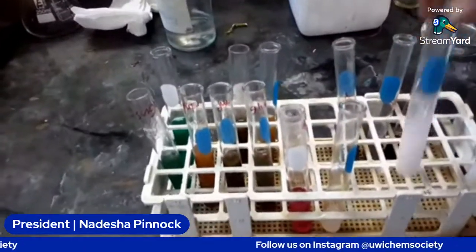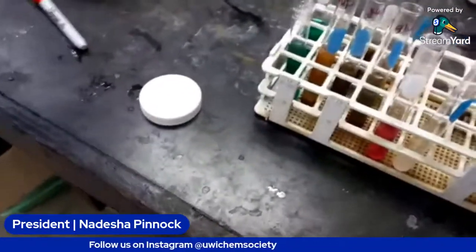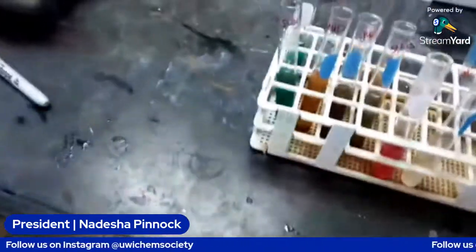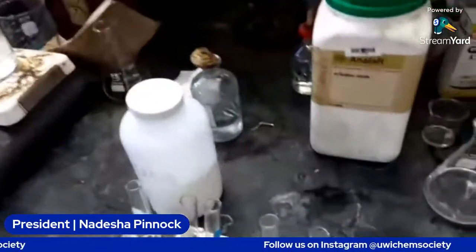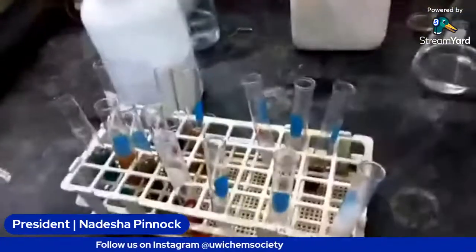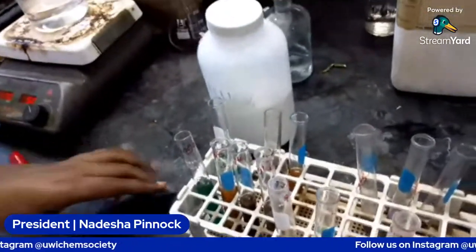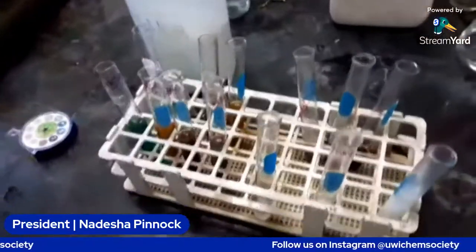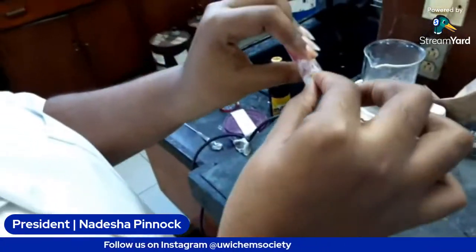So we're going to test the pH again and see how far it reaches. We're testing the syrup.